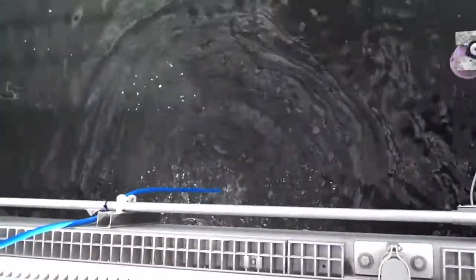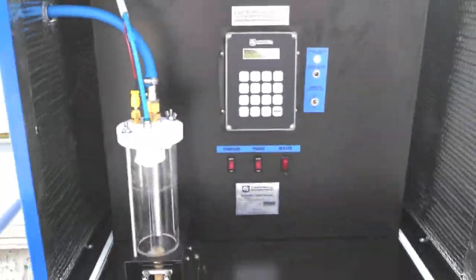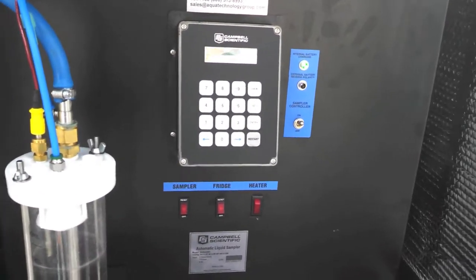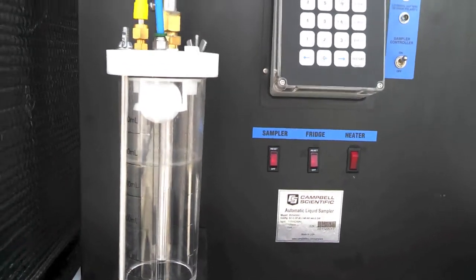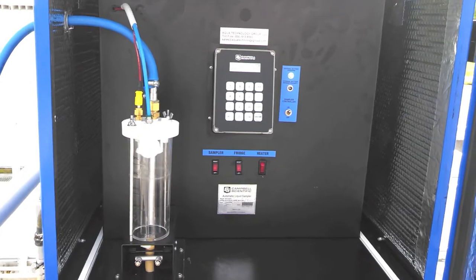We're now in a post purge, blowing the air back out, making sure that there's no cross contamination. So I hope you enjoyed this look at the Campbell Scientific Samplers. These are all set up the same way in the vacuum-based samplers. Be sure to check out the rest of the Campbell Scientific Samplers for vacuum-based sampling — it's simple, reliable sampling.